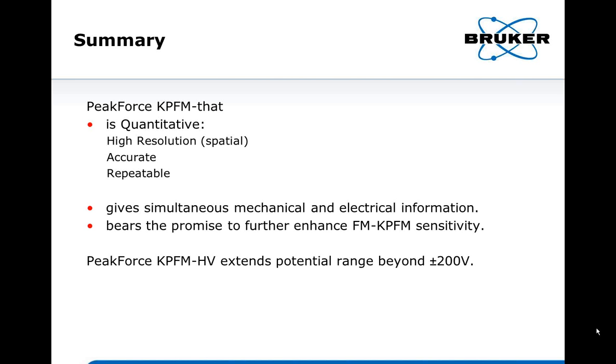For example, for frequency modulation, some papers say if the tip-sample separation is within 30 nanometers, then lift height doesn't really change the value. However, if it's way above 30 nanometers, then it will change with lift height. So I would say you want to keep the tip-sample separation below 30 nanometers. That's not the same as the lift height, because that's not the real separation.